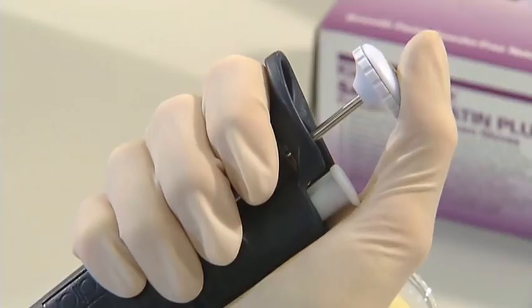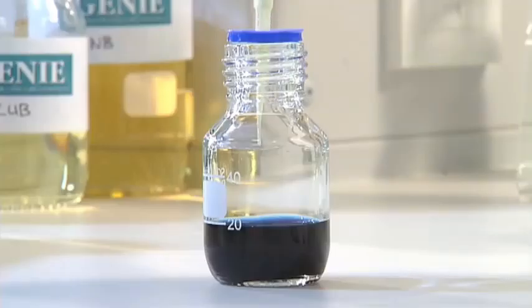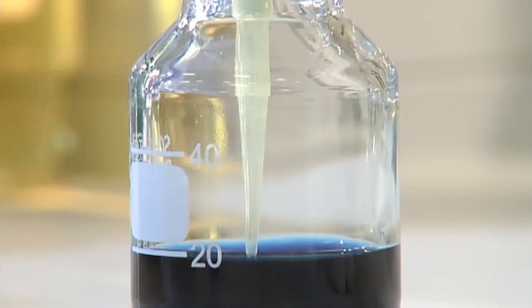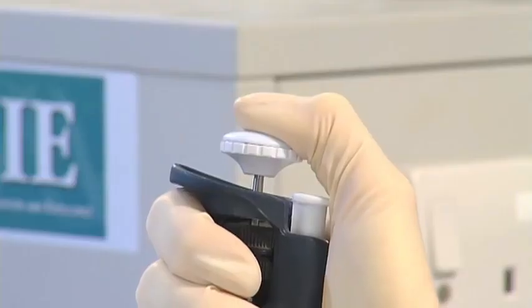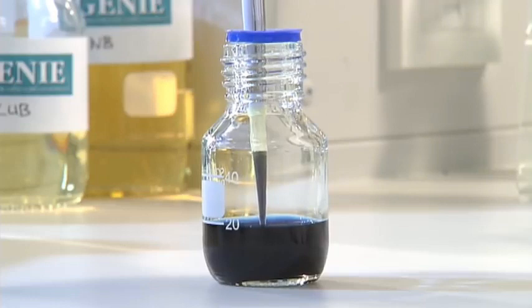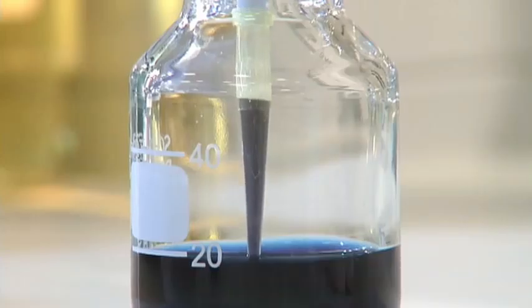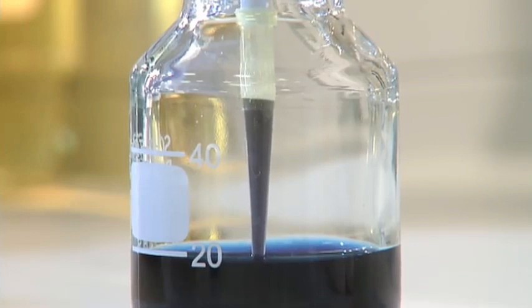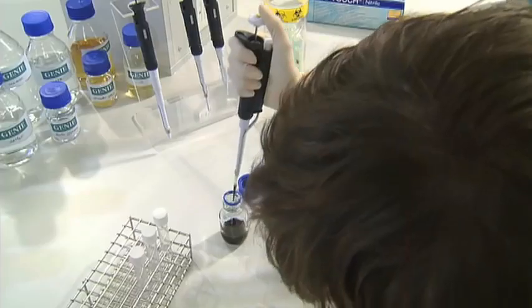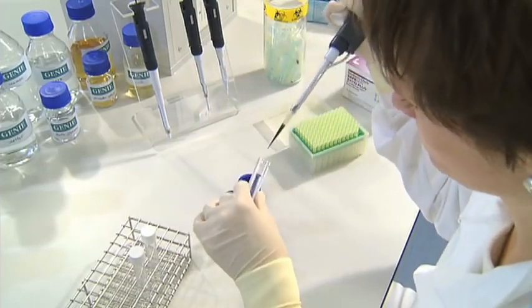So to use the pipette, push the button down to the first stop. Then, keeping the push button at this level, place the pipette tip about 2 millimeters into the liquid you wish to draw up. Release the push button by slowly allowing it to return to its original position. Pause for a second to make sure all the required volume of liquid has been taken up into the tip. This is especially important when using more viscous liquids which take longer to draw up. Withdraw the pipette tip from the liquid and place it inside the recipient container.